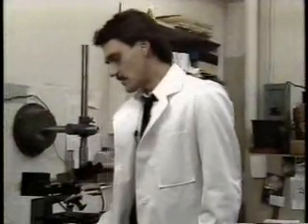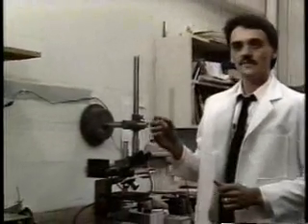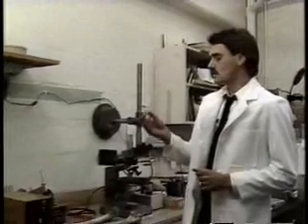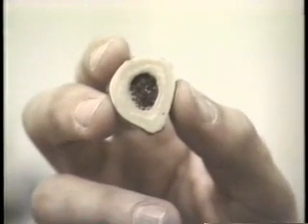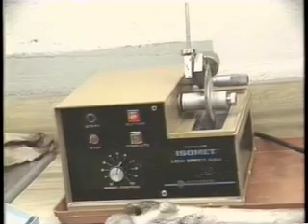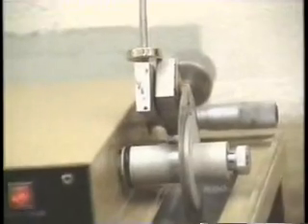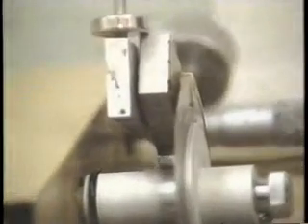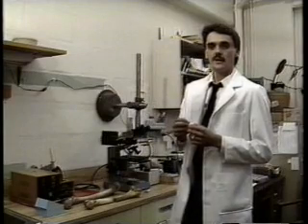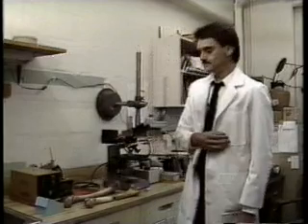A second major problem I feel with this technique is, of course, the time and the effort and the equipment it takes to start with a specimen like this and end up with something you can view under the microscope. There obviously is equipment involved and a lot of manual time. I take a specimen that's been cut off, and I need to grind the specimen down to about 80 microns and then polish it very carefully so no scratches show up under the polarized light.